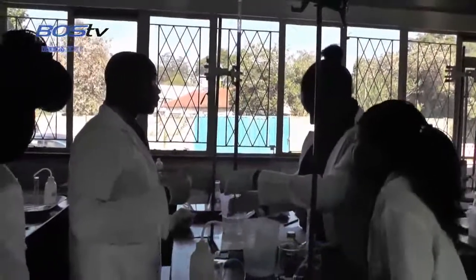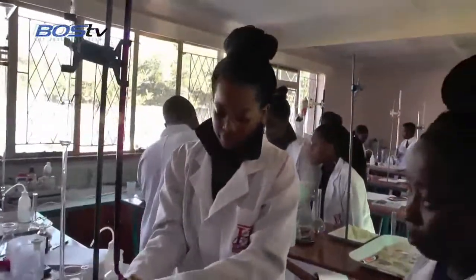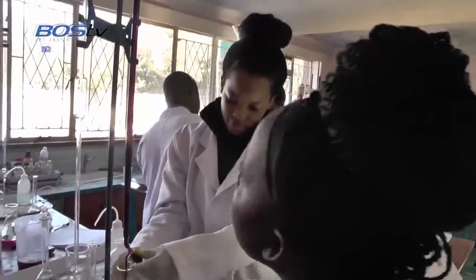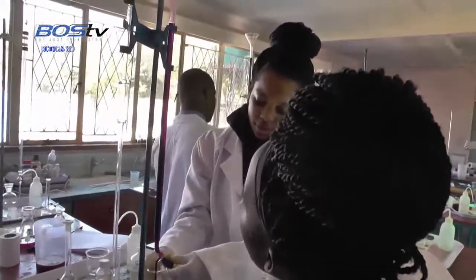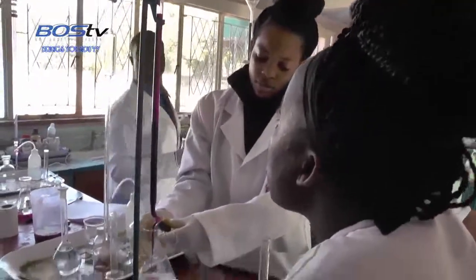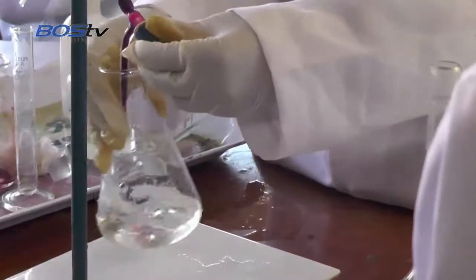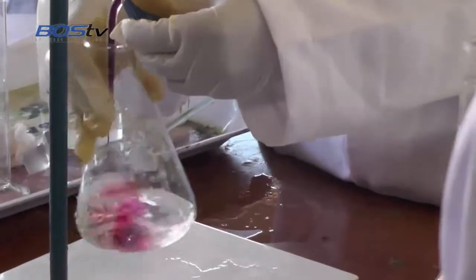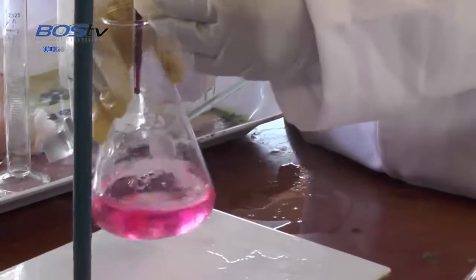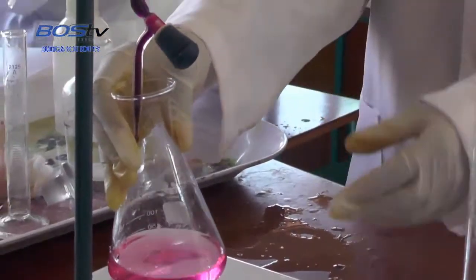You do not have the initial value. Check from there, then you tell me. Control, right? Make sure as you reach the end point, you add drop by drop. Don't overshoot. Yes, perfect. You added 1 extra drop, but it's accurate.